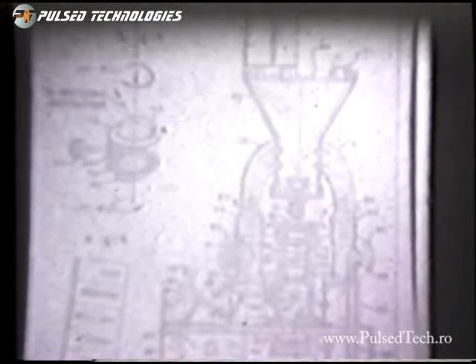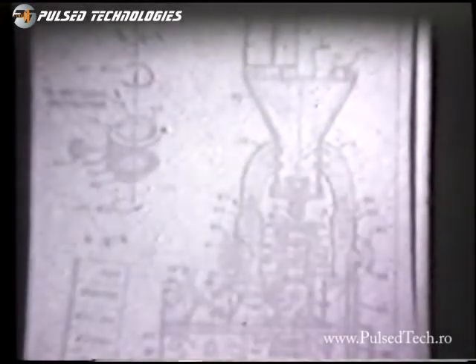The internal view of the microscope and the patented Rife lamp below is shown to bring the system up to the top where a movie camera or other projection system can be used to enlarge the images up to 200,000 times.